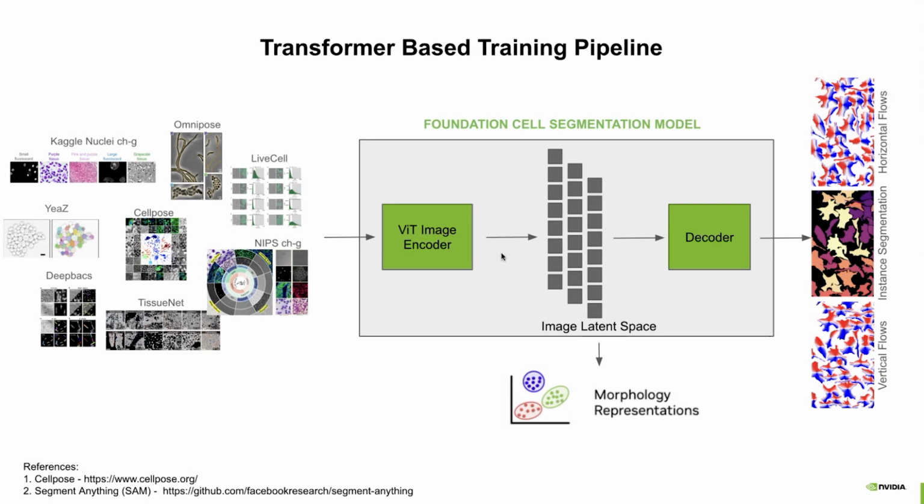We wrote the whole training loop pipeline using all the Monai best practices and Monai building blocks, so that if you use our code as a reference, it's really easy to customize it. You will see all the familiar Monai blocks. It's written to be modular. It's written to be a tutorial if you want to customize the code, or you can also use it as is.